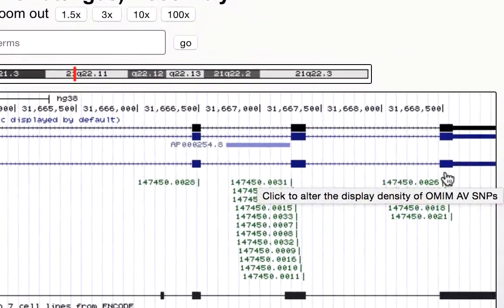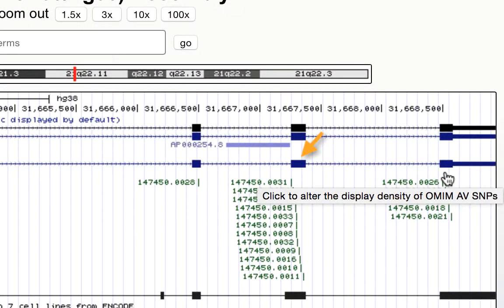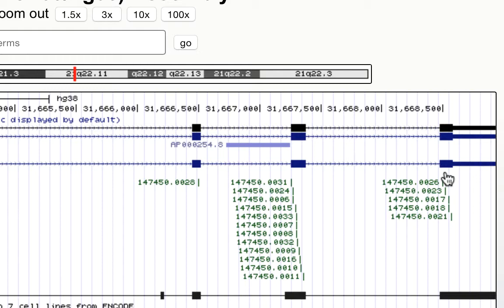Now you'll notice that there are full height and half height boxes. The half height boxes are untranslated regions, whereas the full height boxes are translated regions. The arrows show the direction of transcription.